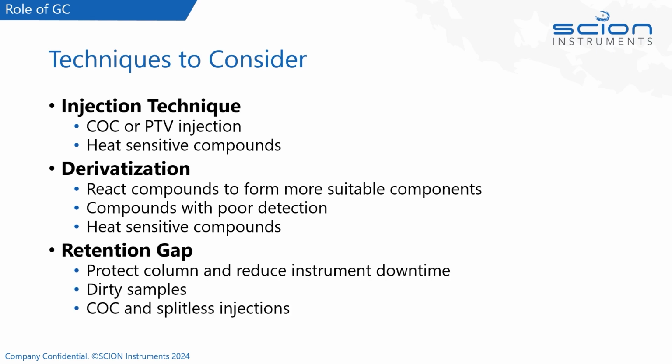Something else we can use is what's known as a retention gap or a guard column. This will basically protect your analytical column and will therefore help reduce instrument downtime. Really useful for really dirty samples and is especially advantageous when we're doing cool on column or splitless injections, as it really helps focus the liquid onto the column with these large volume injections.